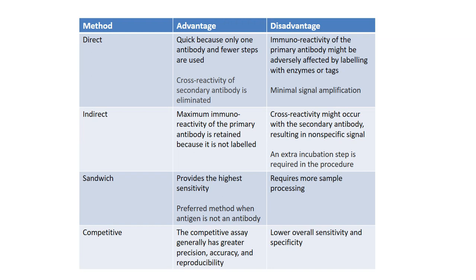In terms of competitive ELISA, it generally has greater precision, accuracy and reproducibility, and the disadvantage is overall lower sensitivity and specificity.